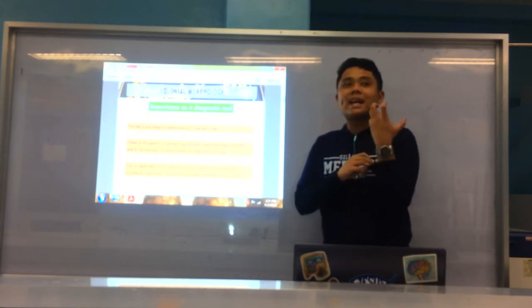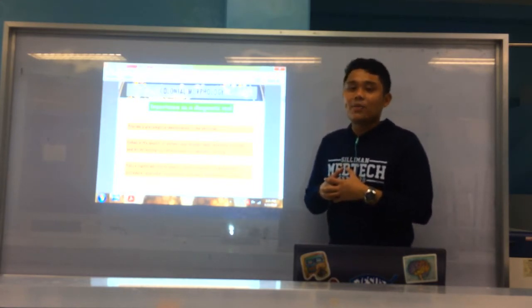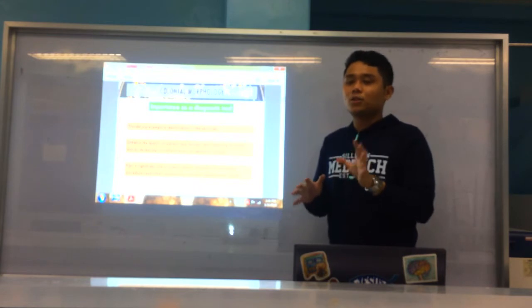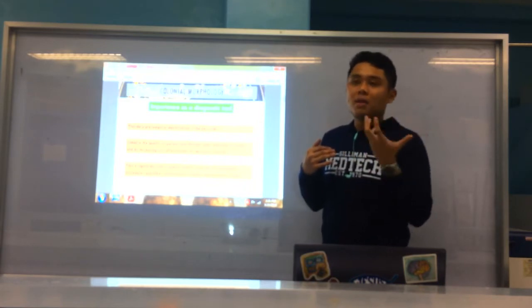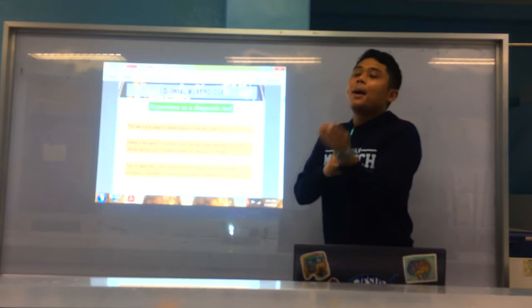Number one, it can give you a presumptive identification of the possible identity of your organism. But that does not mean that it can give you a definite identification. Please take note, don't be confused. Some of you asked, can we identify bacteria through colonies?